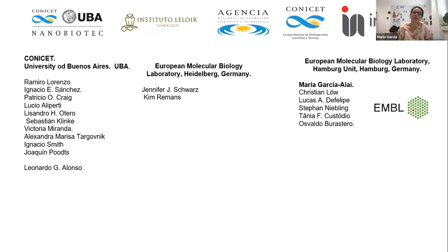And is the resolution you're getting good enough to see this? Yes, we are getting a structure of the deamidated spike protein. What resolution are we talking? No, we are just refining this with the NIH collaborators, but we have a nice picture and a very interesting result, because it affects the position of the RBD, some of the very conserved sites. So we are analyzing the effect of this deamidation, but of course using mutants, not the naturally deamidated sample.